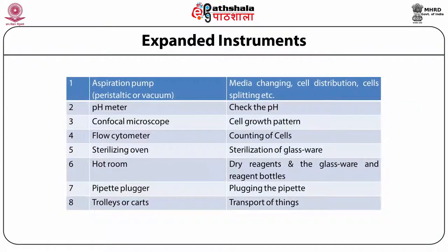Expanded instruments. Although these instruments are not as required as basic equipment, they are also helpful, or I can say that these instruments are equally important as the basic equipment. This category list has the aspiration pump, because you require some procedures like media changing, cell distribution or cell splitting. You need to aspirate the media. This can be performed easily with the help of an aspiration pump.